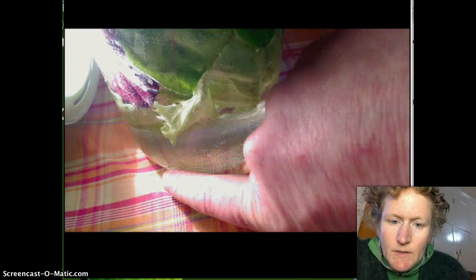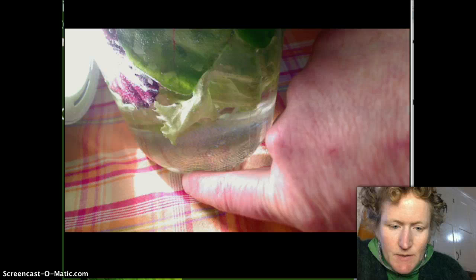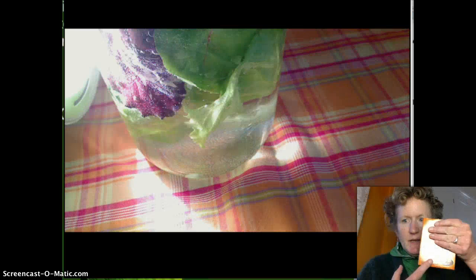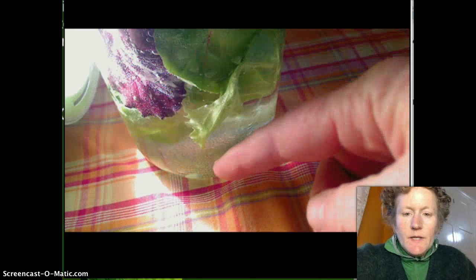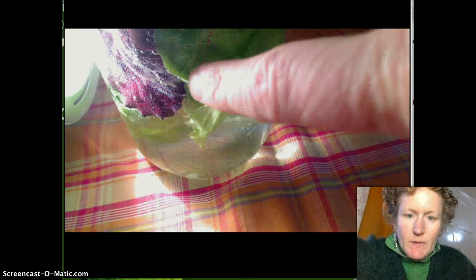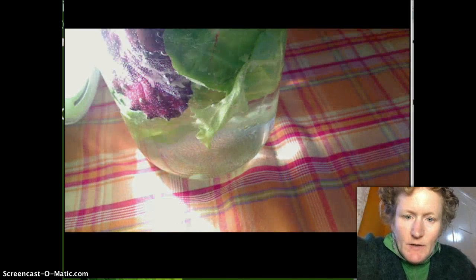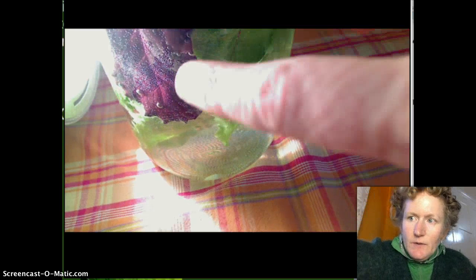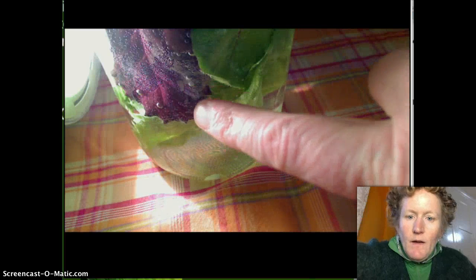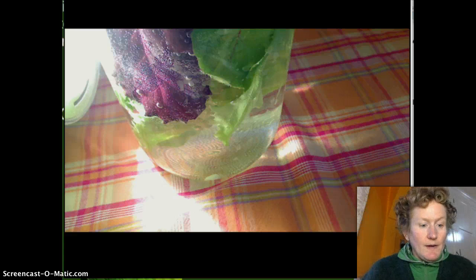Right here you can see a little bit of the baking soda here that didn't dissolve. Baking soda into the jar right here and it dissolved. The plant took it up, photosynthesized and these little bubbles right here are oxygen. See how they're clinging to the leaves? Because the leaves are photosynthesizing. And you'll notice right here not all plants are just green. Some of them have other pigments in them that make them look not green.